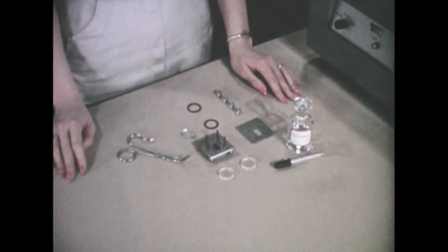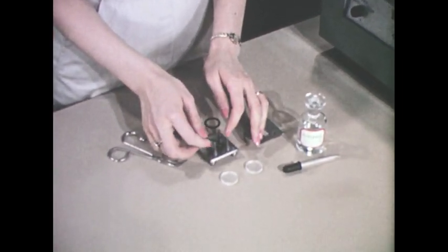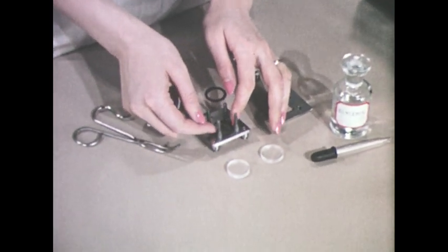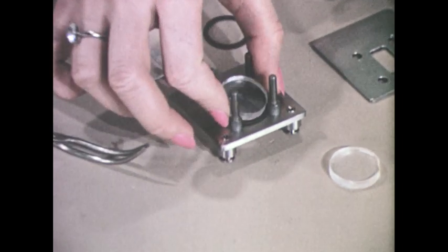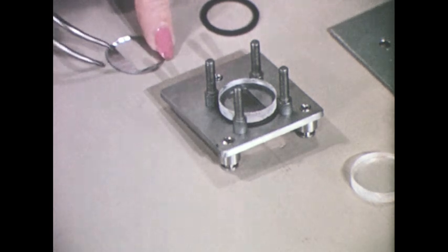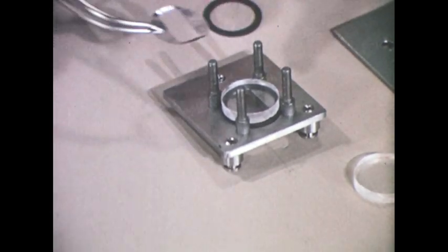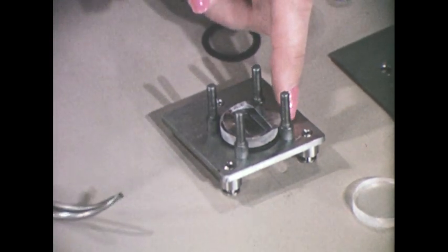Liquids are placed in a demountable cell, which is assembled as shown. The windows are sodium chloride crystals. Lead or aluminum spacers from 0.01 to 1 millimeter determine the sample thickness in the infrared beam.